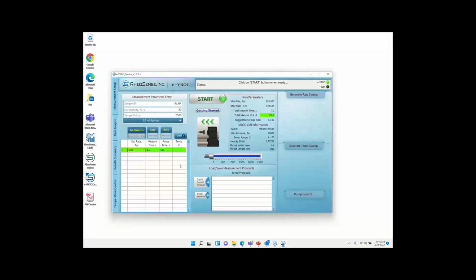There's one more question: when testing at high shear, how do you determine if there are secondary flows? Okay, remind me to answer that in a second. I'm going to start the priming of the chip.